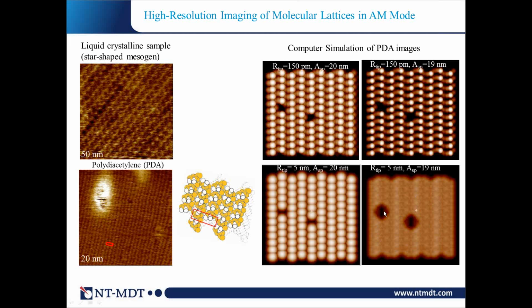Therefore, at the moment, I don't think we achieve true atomic resolution with AFM. To do so, we need to go to lower forces and sharper tips and make instruments which can perform under these conditions. However, getting these lattices is a good demonstration of the general performance of the instrument.